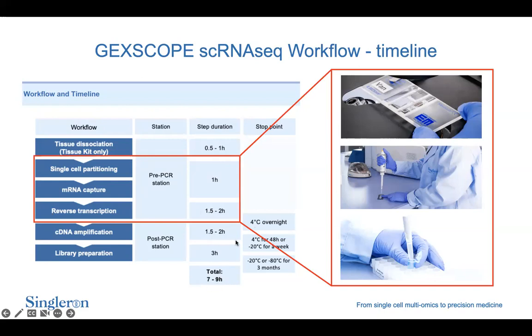The majority of the time that this workflow takes is the cDNA amplification and the library preparation steps. And there are several opportunities to stop this workflow once you have your cDNA. So there are multiple possible breaks. You don't have to do this whole workflow within 1 day if it doesn't simply fit your schedule. It's quite flexible.